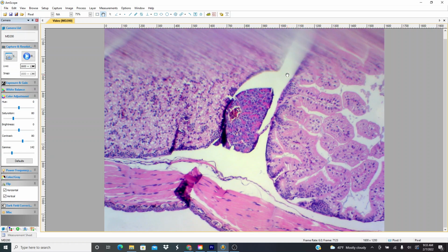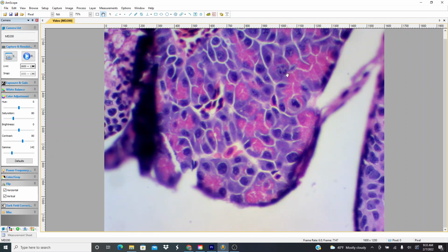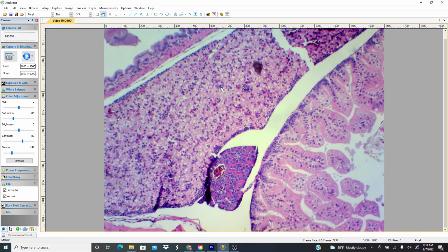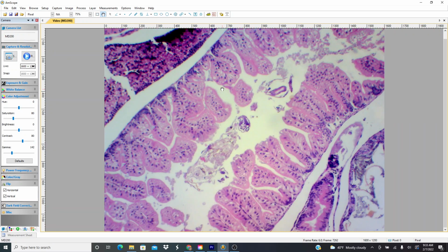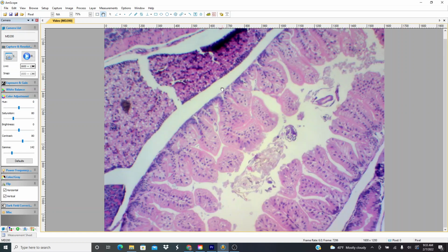Now, this structure has these cells with granules, these bright red balls. I don't know what they are. Pretty interesting. That looks like some kind of organ, and now over here, it looks like the gut, back into the gut again in this longitudinal cut of his gut.